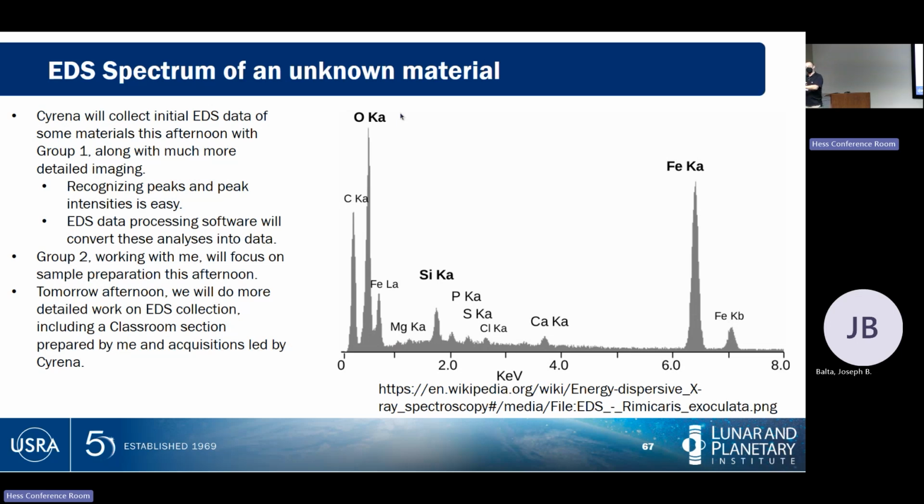And then tomorrow afternoon, I'll go through the basics of EDS analyses in more than 2 slides, as well as how to look at and deal with some of the data. And then tomorrow afternoon, Serena will start collecting EDS analyses with you folks on some of these samples. And then towards the end of the week on Friday, once we've done EDS analyses on both spots and mapping, we will start putting those together with image processing to actually map out where material is and different phases on surfaces.